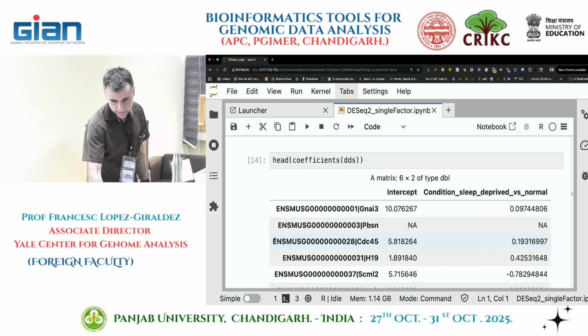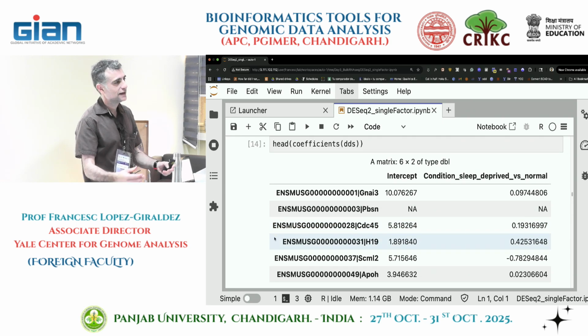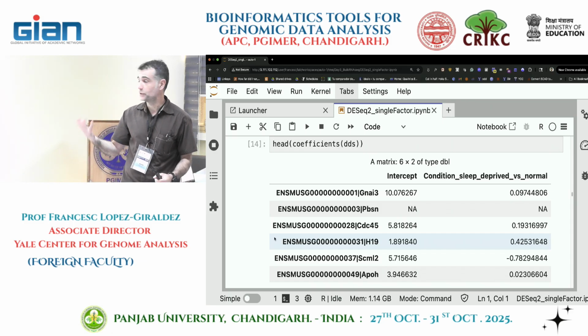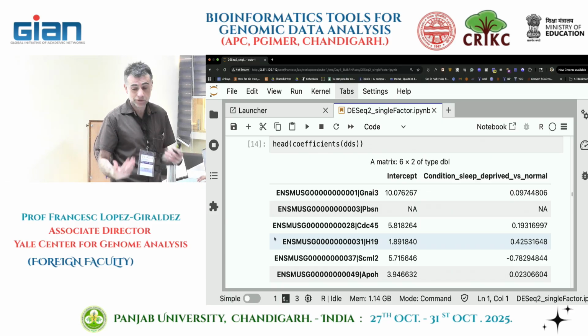So where we ended up in here, right? That's what we did. Visualizing the coefficients. Again, this is not a step that you're going to do in your analysis normally. We're just exploring the data, so you get familiar with how to access it if you need to.